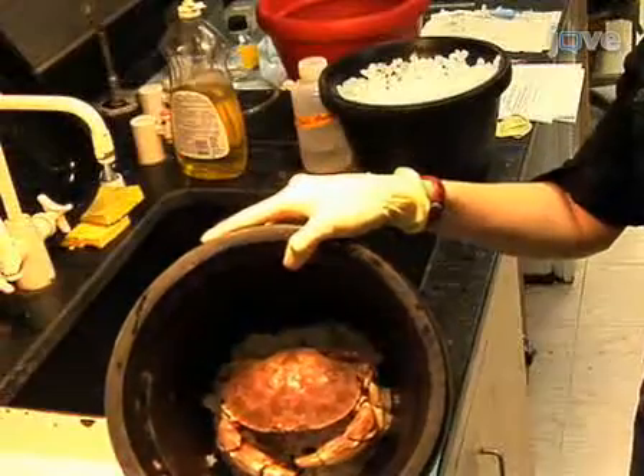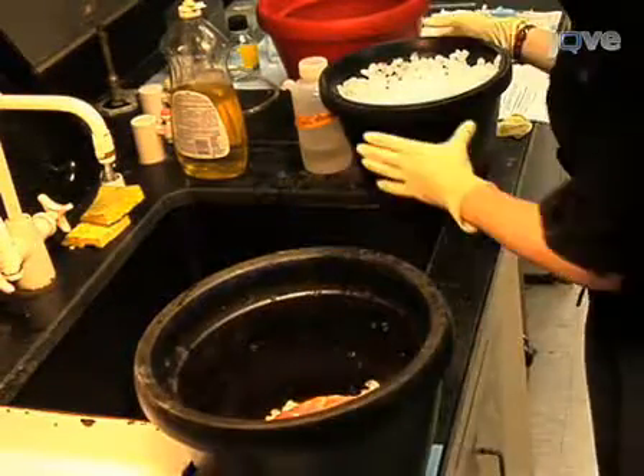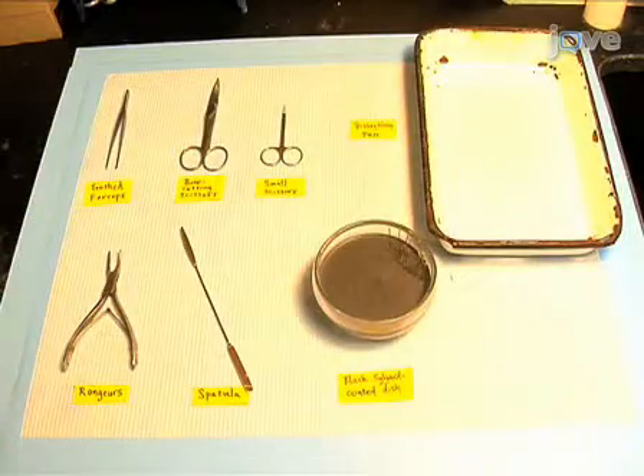Before starting the dissection, the crab must be numbed by burying it in ice for 30 minutes. Be sure to surround it on all sides with ice. The ice dulls the crab's sensory and motor systems, but the crab might still be responsive when removed. While the crab chills, prepare for the gross dissection by assembling the equipment required for this part of the protocol.